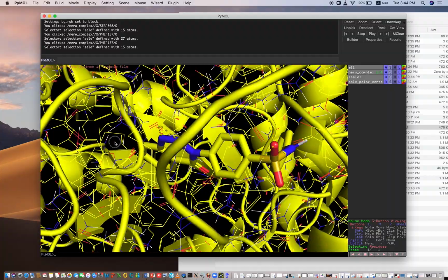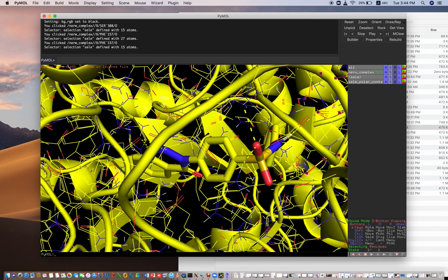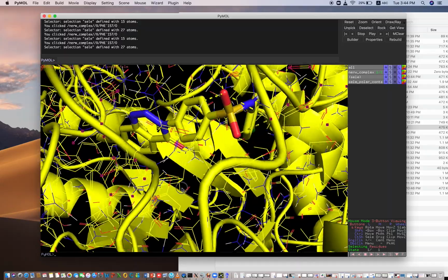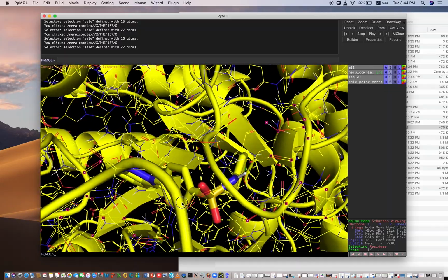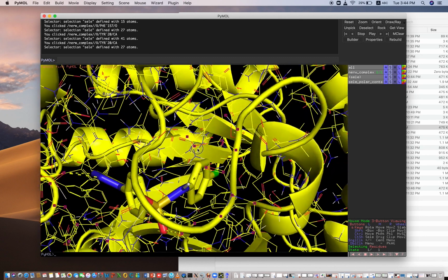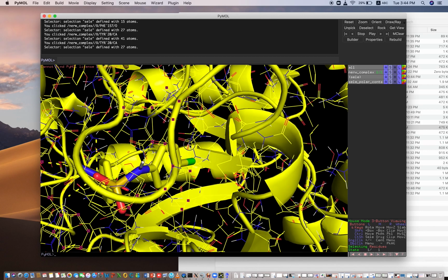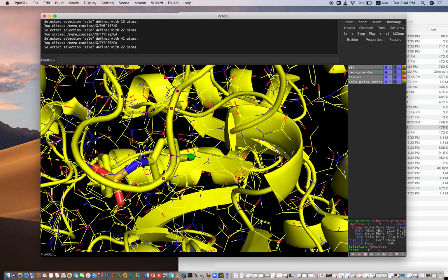Confirming it. It will be a little bit tricky, but you can do it easily. Okay, which one is left? I think this one. I'm just confirming this. Yes, this is the residue.